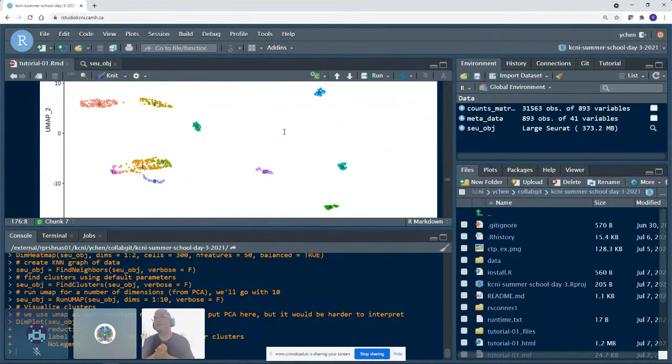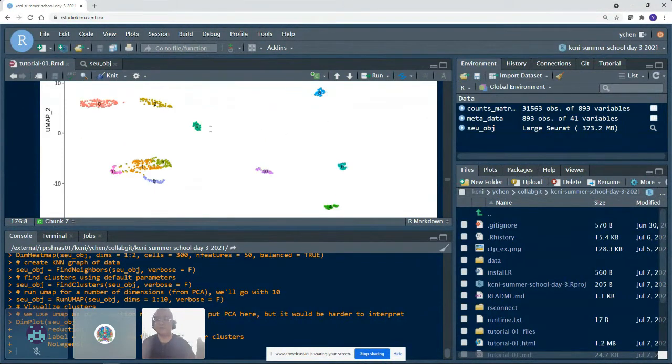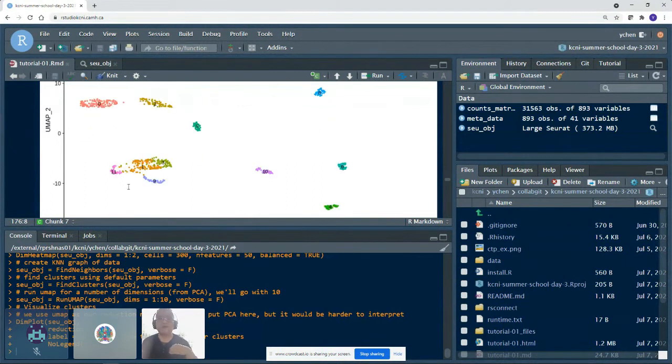So hopefully that was fairly clear for people who have some general idea about clustering. For those who have perhaps less of a background in math, just know that we summarize all of those 32,000 genes into 50 variables or 2 variables, and then we just want to find all of the dots that are closer together. And we do this in a mathematically robust and rigorous way.